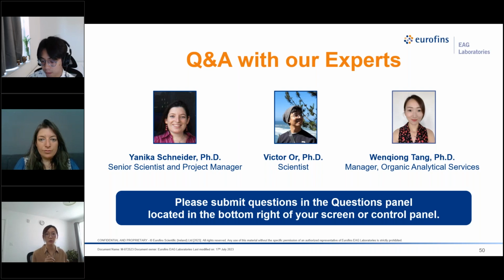Alternatively, we have a very powerful tool called a grazing angle ATR attachment in our lab. By using this attachment, you can increase the incident angle from typically 45 degrees for most ATR attachments to as high as 65 degrees. This grazing angle incidence really helps to achieve much higher sensitivity. And grazing angle ATR works pretty well to characterize really thin films or surface modifications.